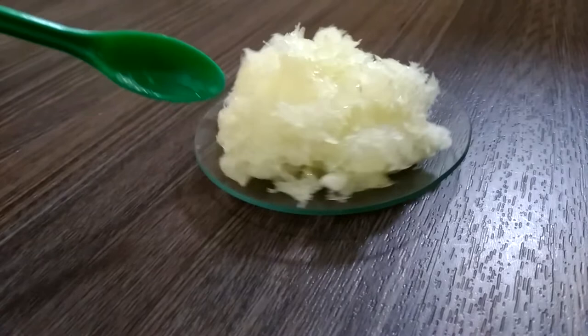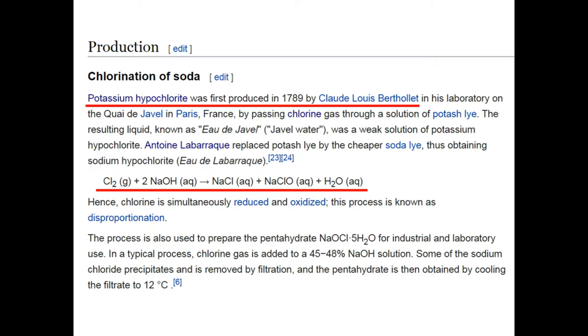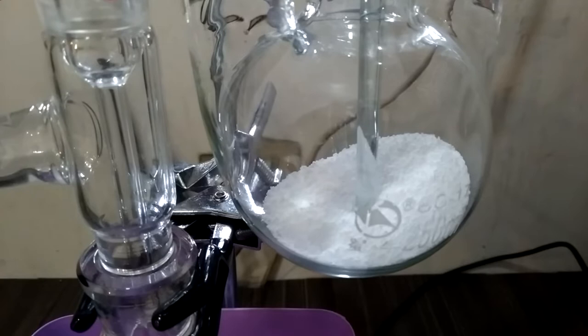Hello everyone, welcome to my lab. Today we're going to make some sodium hypochlorite pentahydrate crystals. Sodium hypochlorite is the oldest and one of the most important chlorine-based bleaches. The synthesis looks quite straightforward — only two starting materials: sodium hydroxide and chlorine. Simply mix them together, filter out the sodium chloride, recrystallize, and we've got sodium hypochlorite pentahydrate crystals.